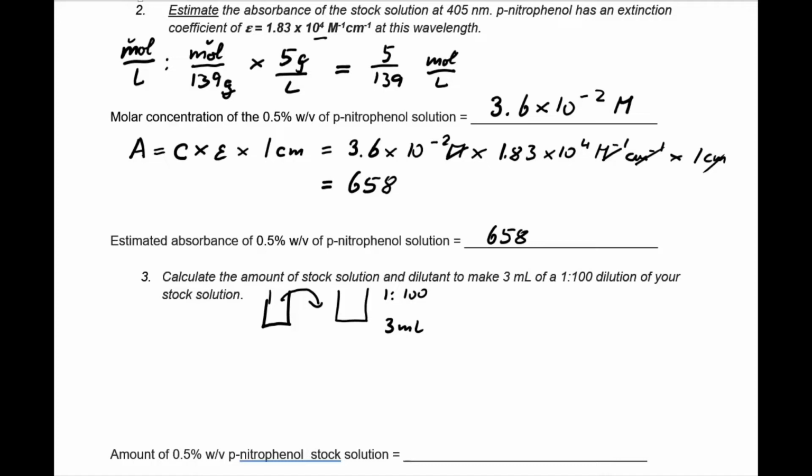So that's the task, and that's very easy when we work with dilution factor, because we can say, okay, we want 3000 microliter, that's the same as 3 milliliter, times 1/100, that's our dilution factor. And we don't even need a calculator for that, that would be exactly 30 microliter.